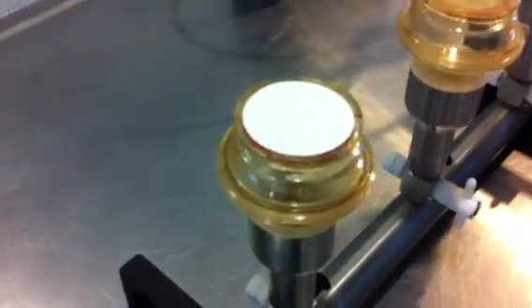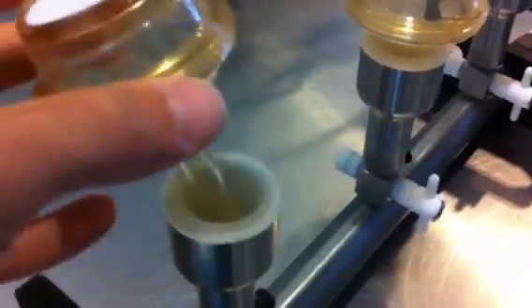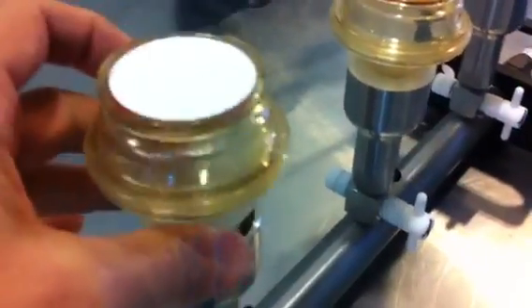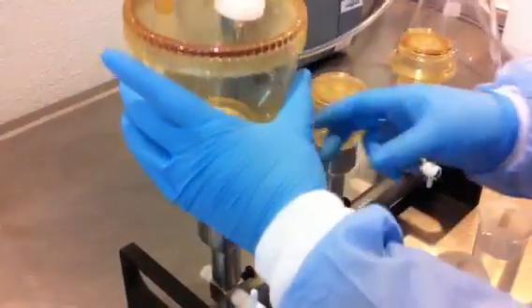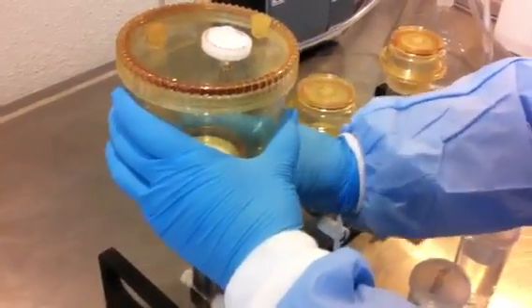So we're starting by putting the membrane filter on to the frit — this is called the frit — and this is an adapter that goes on to the manifold. Then we attach the funnel to the frit, which is holding the filter, and we do the same for the other two.